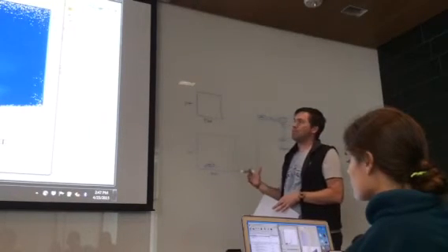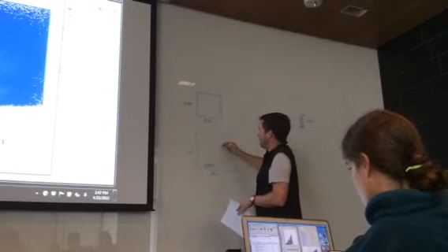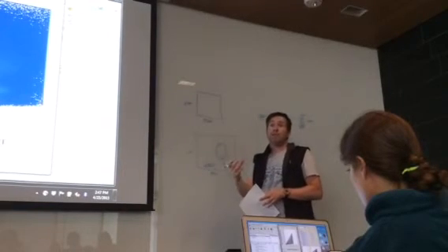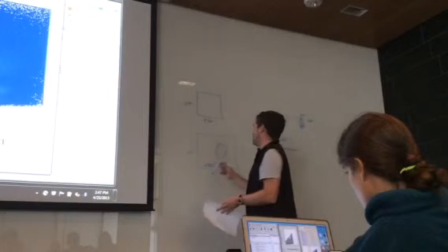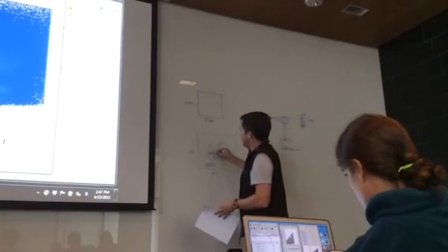If you were to look at something a lot larger with a lot more granules, like granulocytes and monocytes, you would find them over here. If you were looking at something that also had granules from granulocytes but wasn't quite as big, such as neutrophils, so this would be monocytes here, right here you would find neutrophils.